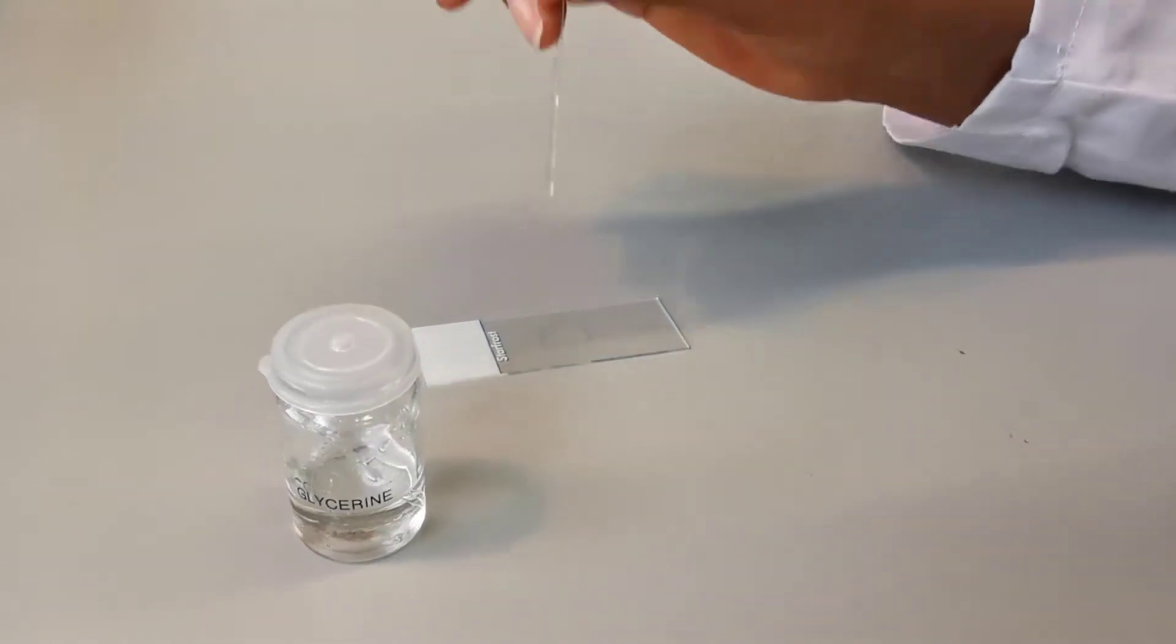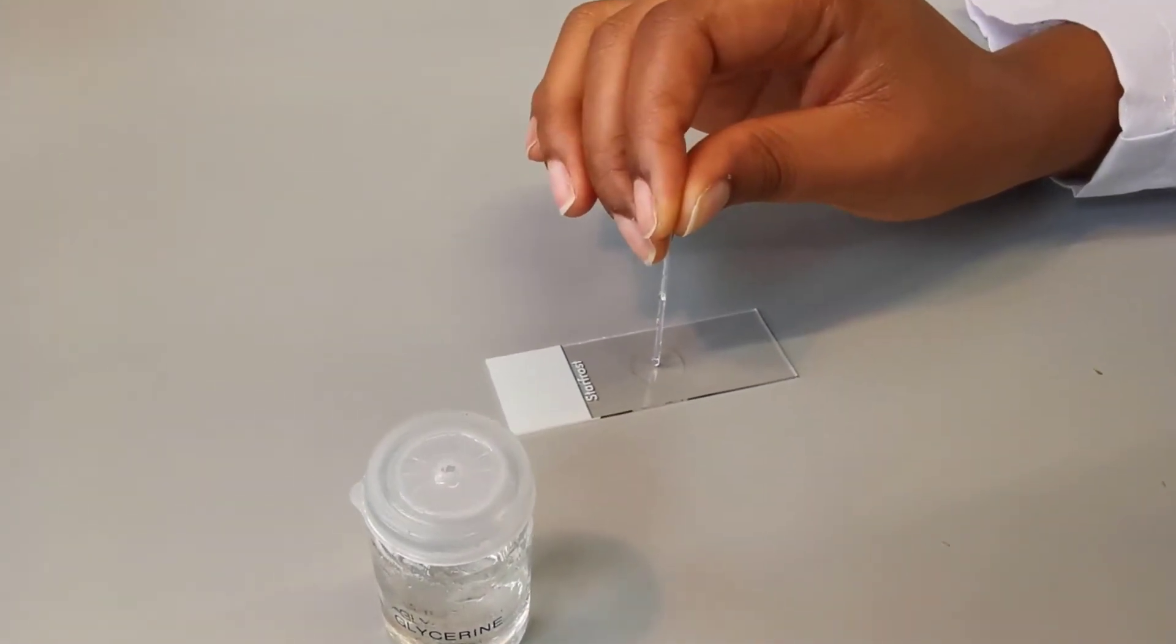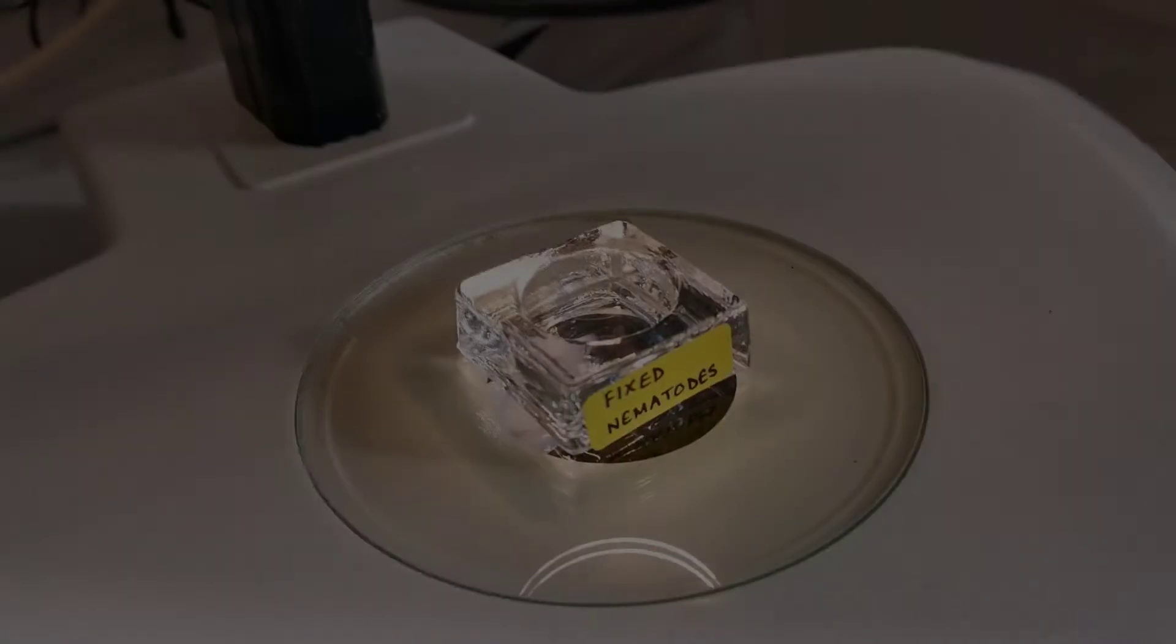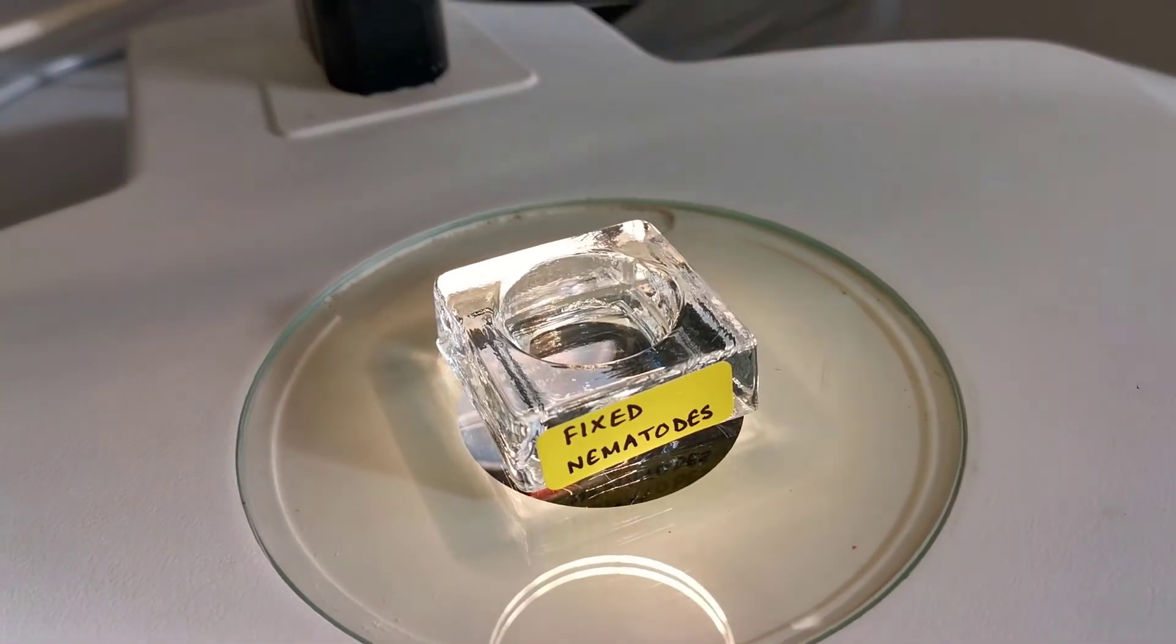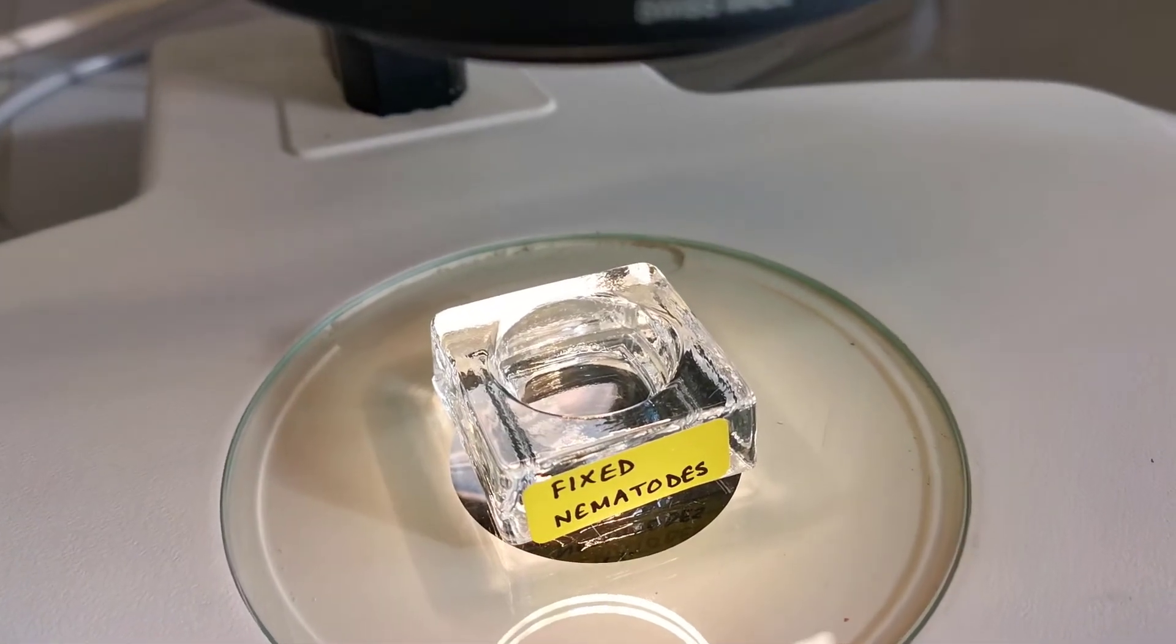The next step is to transfer a small drop of glycerin in the middle of the wax ring. And at this point, we will take our nematodes fixed in 4% formaldehyde and stored in glycerin medium.